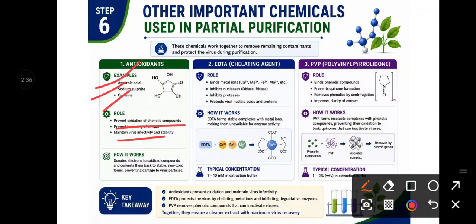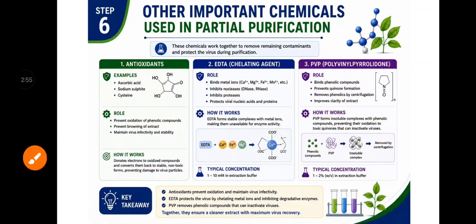It is a virus protectant. How? Because EDTA acts as a chelating agent. It chelates the metal ions. By chelation of metal ions, it inhibits various degrading enzymes like proteases and nucleases, because virus is a nucleoprotein structure.